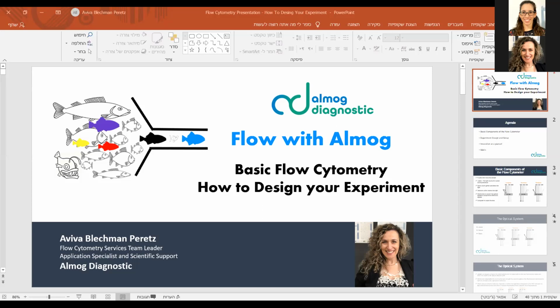Is there a method to increase the intensity of compensation beads in cases where the samples give a stronger signal? So what you can do is add more antibody per the same amount of beads. In order to get the full staining of the compensation beads, the antibody should be added in higher volume, higher concentration of antibody per beads than you use for your cells.